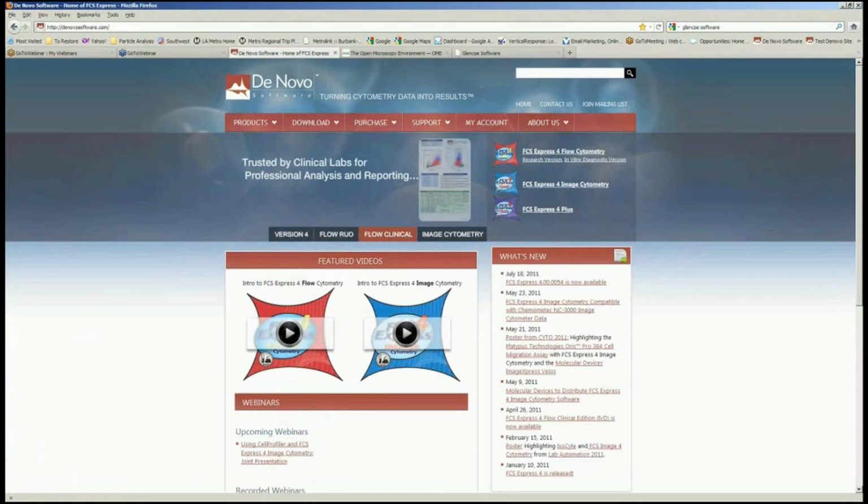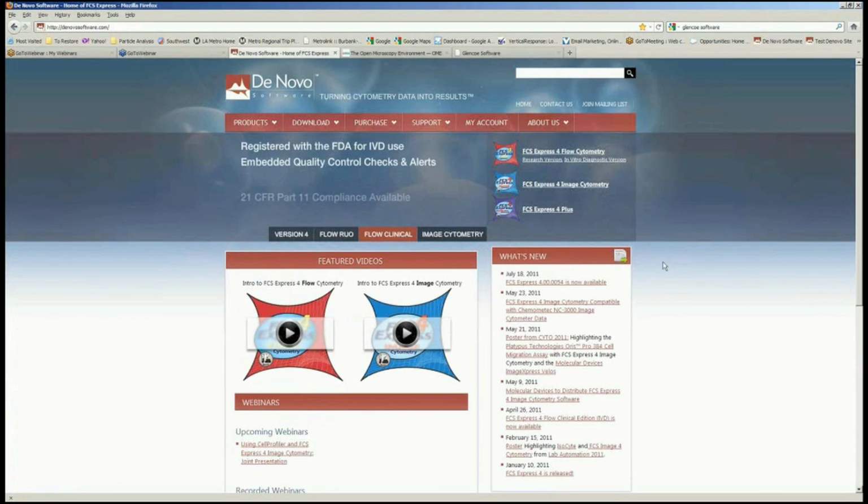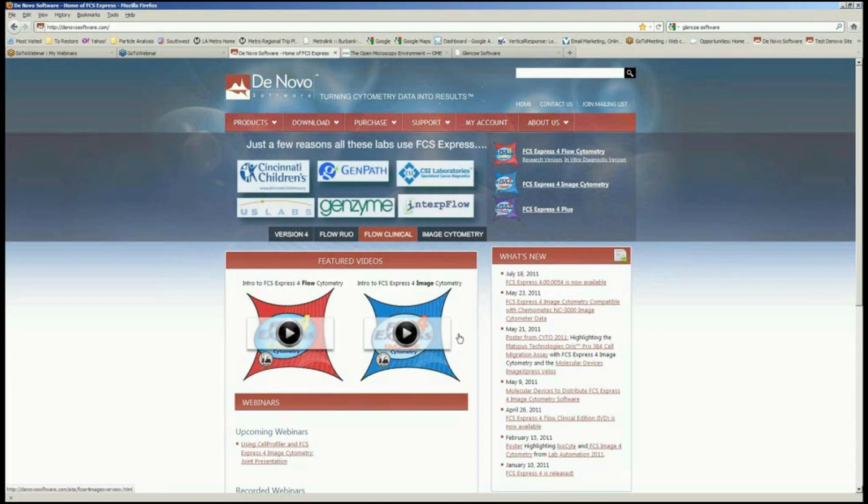We do an awful lot of support in both cases, actually, through the website. On the DeNovo Software homepage, if you want to learn more about the Image Cytometry or the Flow software, there's immediately available a 10-minute video highlighting the features of both.